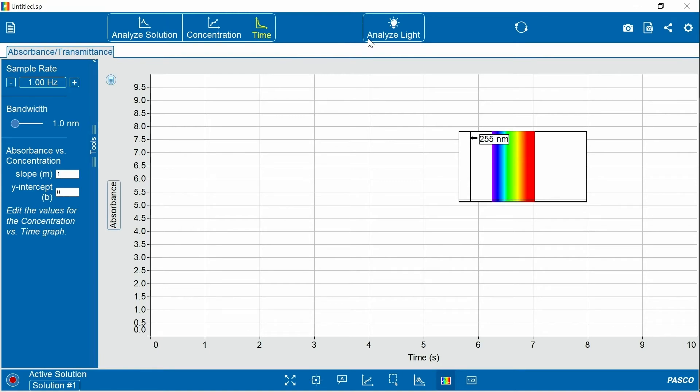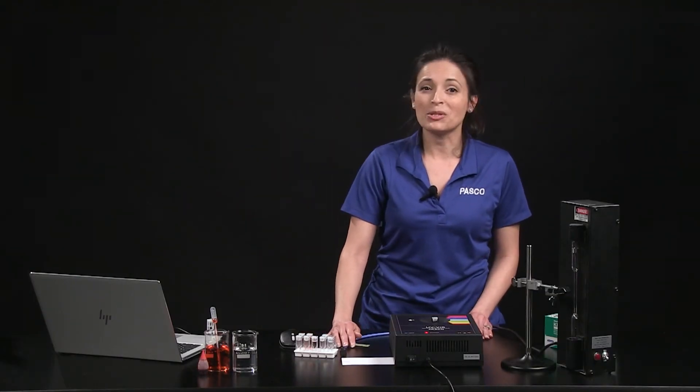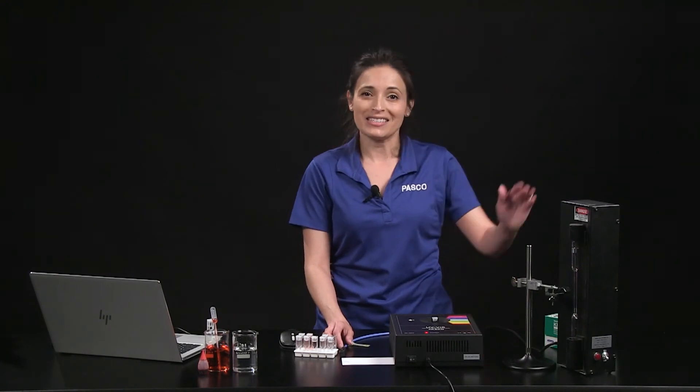And if you go to the Analyze Light tab, you can use the optional fiber optics cable to identify an element in a gas discharge tube or explore atomic energy level transitions.